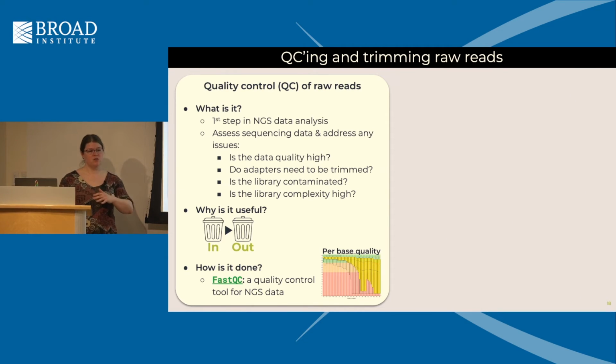You want to check your sequences too. I recommend using FastQC, and you basically want to make sure, is your data quality high? Do you have really short sequences and you're running into adapters on either end? Some aligners will automatically trim adapters, I learned the other day. And this is useful because garbage in, garbage out. You want to make sure that you're dealing with good quality reads and data, and not marginal quality reads and data before you invest a ton of time into your analysis.